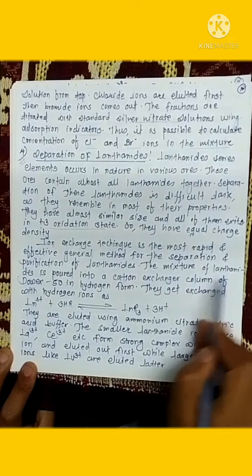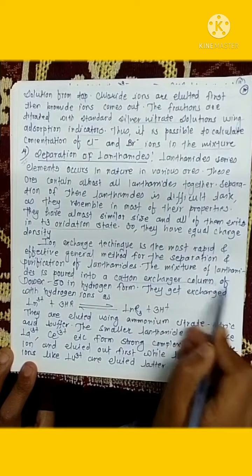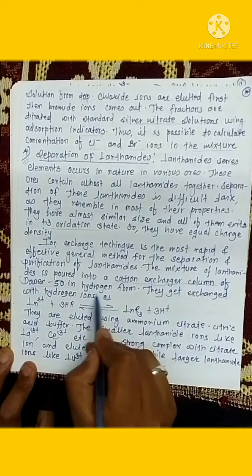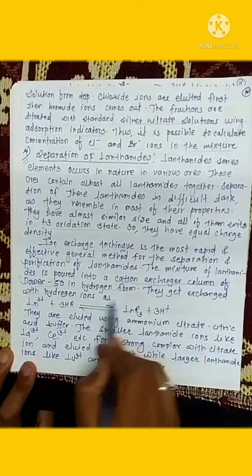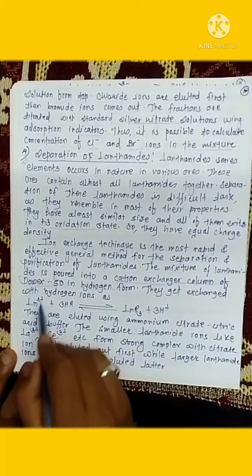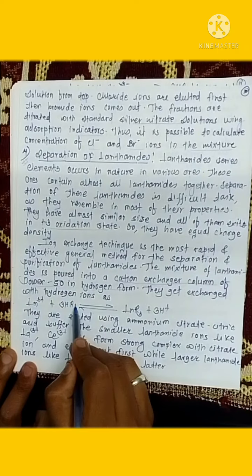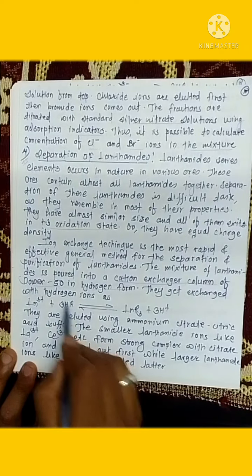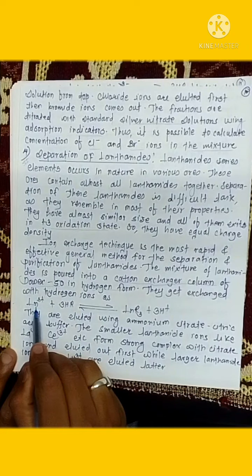The mixture of lanthanides is poured into a cation exchanger column of Dowex 50 in hydrogen form. They get exchanged with hydrogen ions as follows. Just see here, your lanthanides, which are present in 3+ state, when they come in contact with Dowex 50 in hydrogen form, the hydrogen is replaced by the lanthanides.